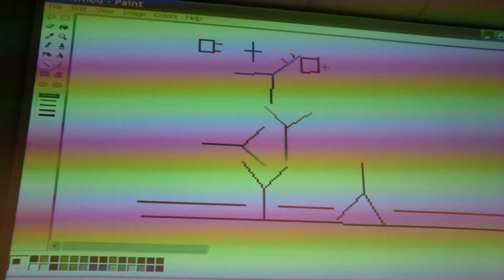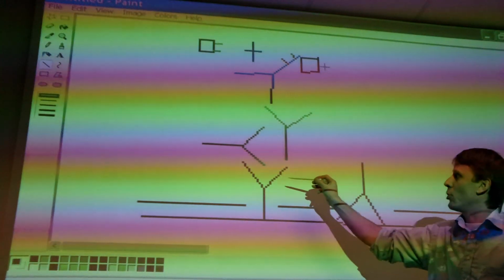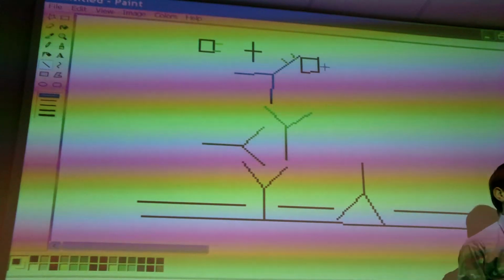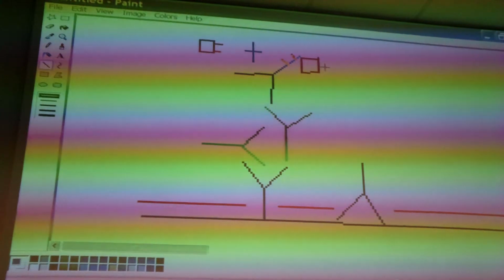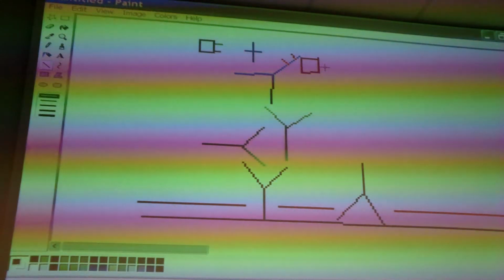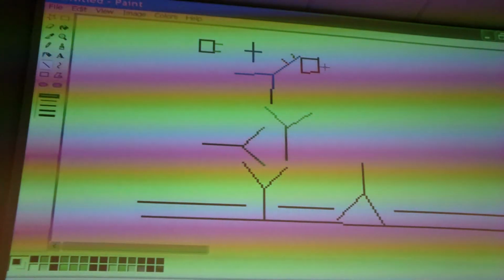Not 100%, because typically this is one goat, and that is another one, and they have different allotypes, so they don't have exactly the same immunoglobulins, and they still might cross-react to some extent. I've seen that happening. So how can we reduce this possibility? Blocking before adding the second one?